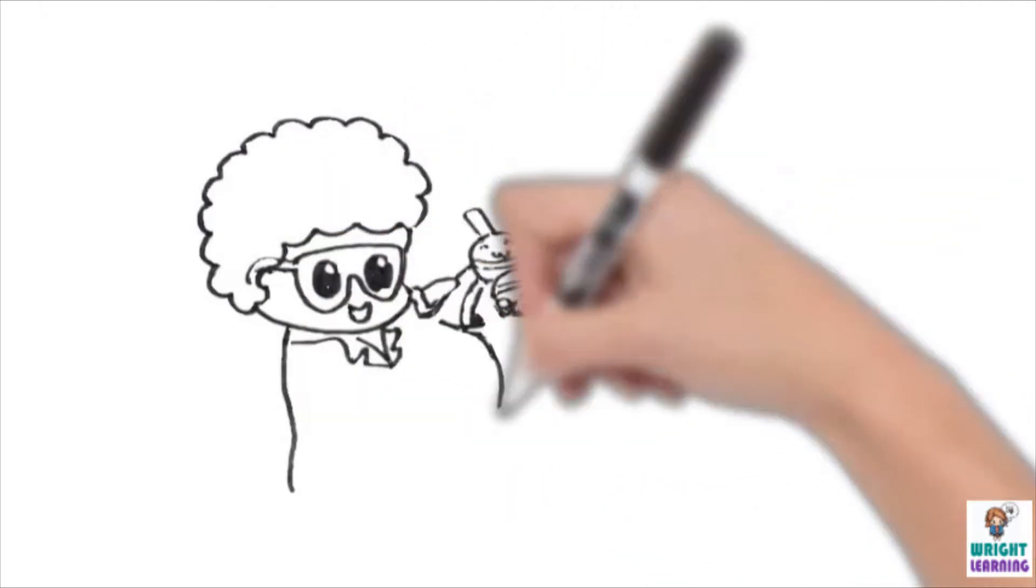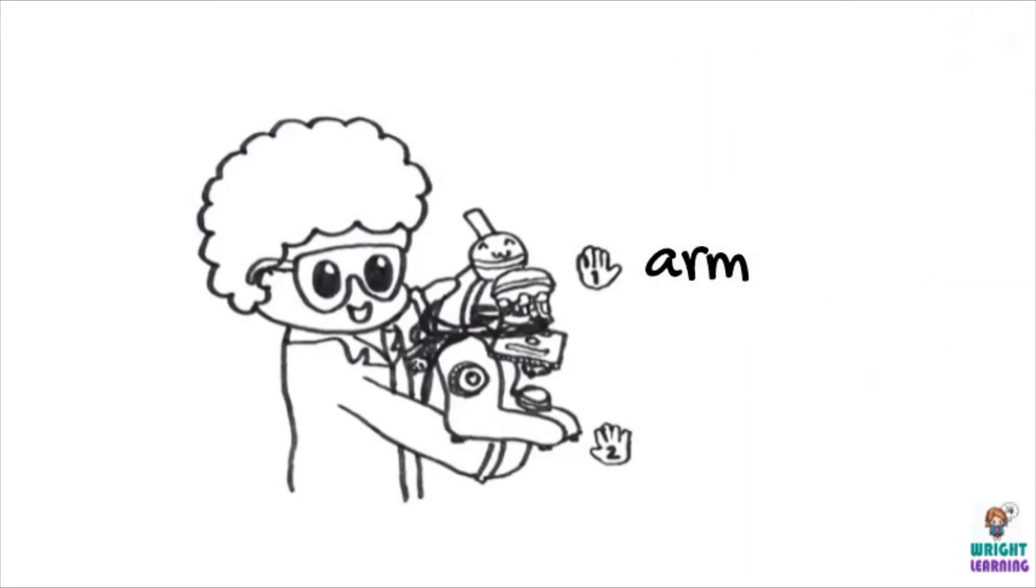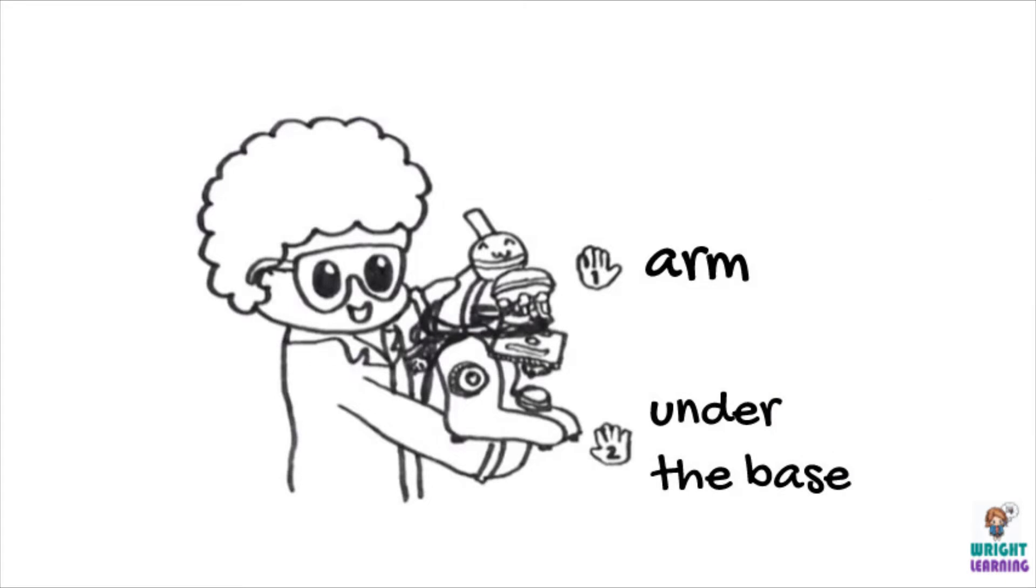Always carry the microscope with two hands. Use one hand to support the arm of the microscope, and place the other hand underneath the microscope's base to support most of its weight.